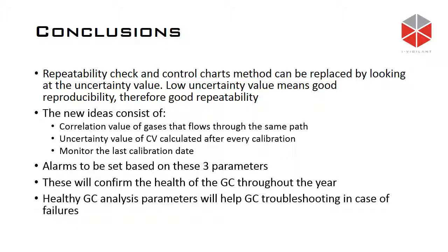Last but not least, the healthy GC analysis parameter needs to be saved, and this basically will help us pinpoint the issue when we troubleshoot a GC. Although some of the tools in terms of the new ideas will help us determine what's wrong with the GC as well, knowing the healthy value of the parameters will help us confirm our diagnostic as well.